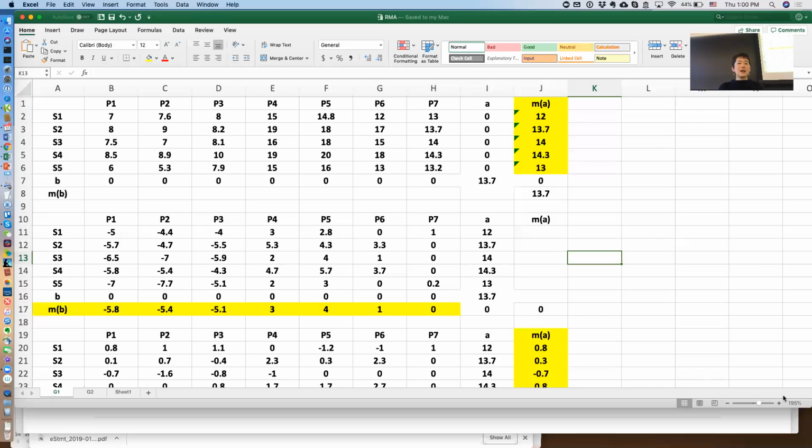Okay, so let's look at an example of how RMA uses median polish to estimate the expression index. In here, the rows are the samples and the columns are the probes. Ideally, when you run RMA, you want more arrays, 6 or 10 or 20 arrays or samples at a time. For example, I'm only going to show you 5 samples.